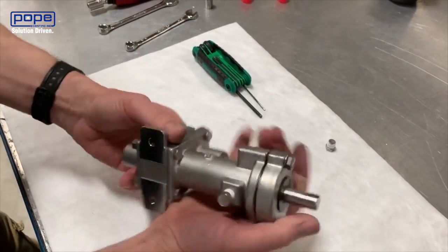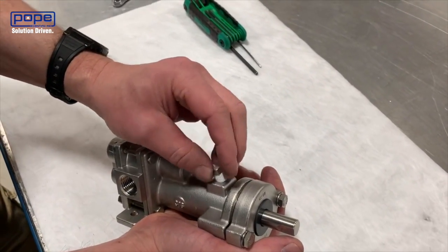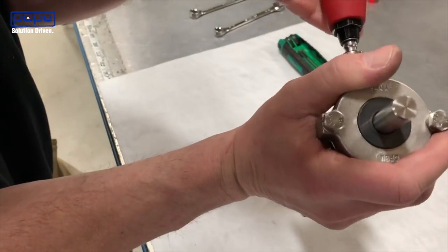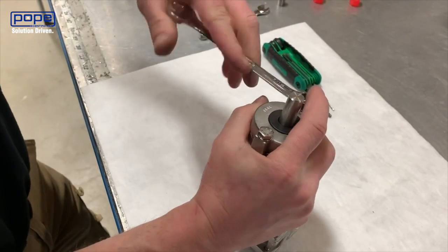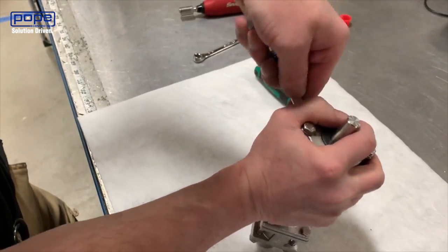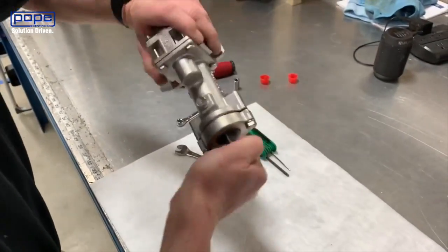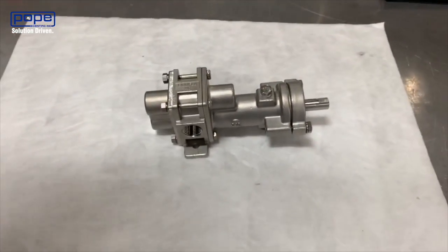Then insert the plugs on either side. You'll need Teflon tape on these plugs so that they seal appropriately. Set those to 40 inch-pounds as well — or if you don't have a torque wrench, just wrench-tight with a little bit of force, but you don't need to crank down too hard. Then rotate the shaft and ensure you still get good rotation. Now your pump is reassembled and ready to go.